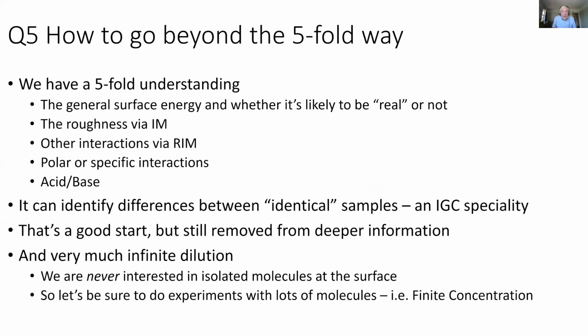This is a great start, and it can identify differences between quote-unquote identical samples, and that's an IGC speciality. And I'm delighted that Julien, for example, pointed out that you get very distinctive differences. I didn't always agree with his explanations, but I absolutely agree that having those differences is really vital. That's a good start, but we're still removed from deeper information. And that's where the terror of people for finite concentration is unhelpful.